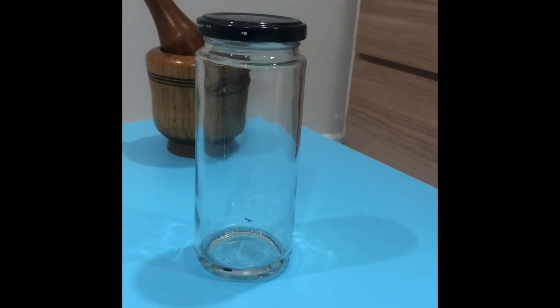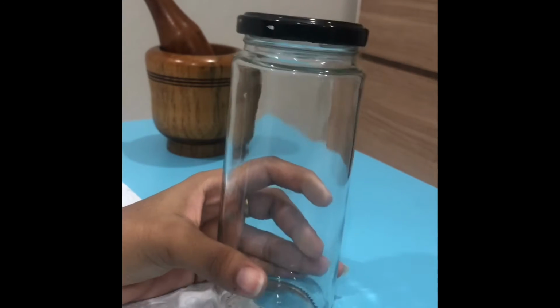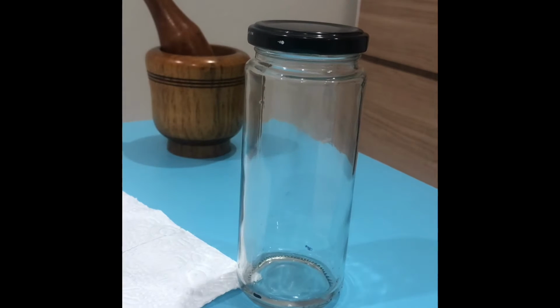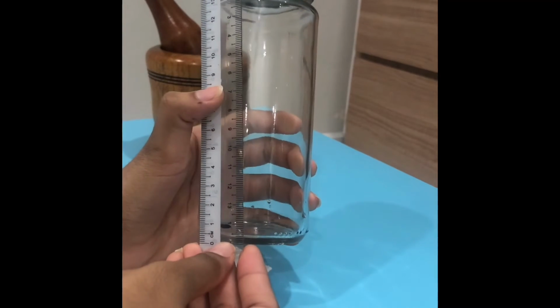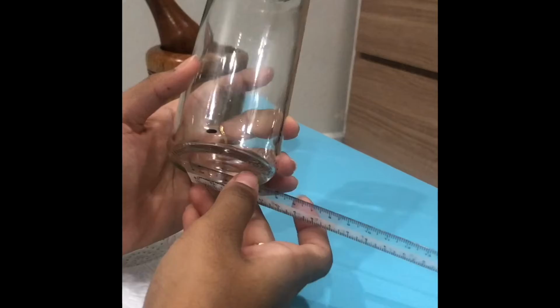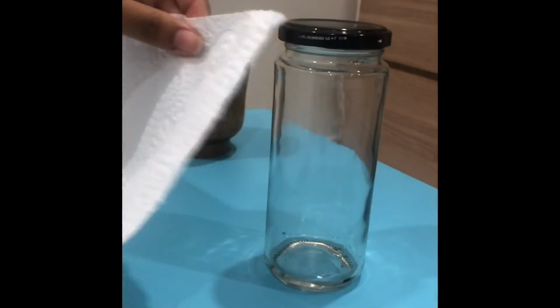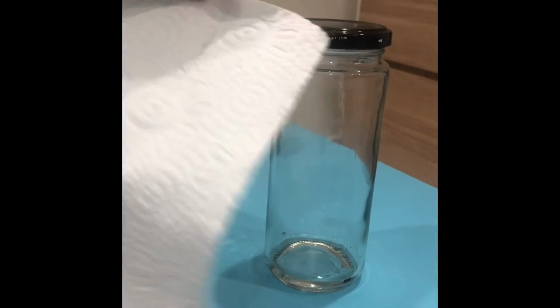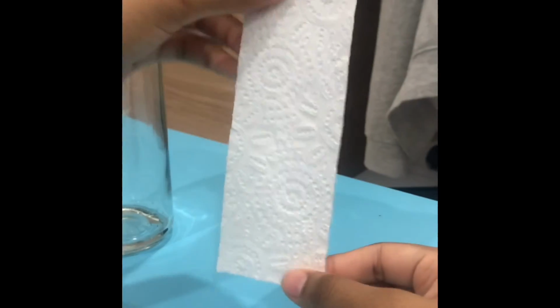The next part is to prepare the TLC plate. So how I would prepare it is by measuring the jar. As I've already measured earlier, this is approximately 15 cm, including the stopper, and the diameter was about 5 cm. So I've measured that out, and this is how it looks. And now I will cut it out. After cutting it out, this is how the TLC plate looks.